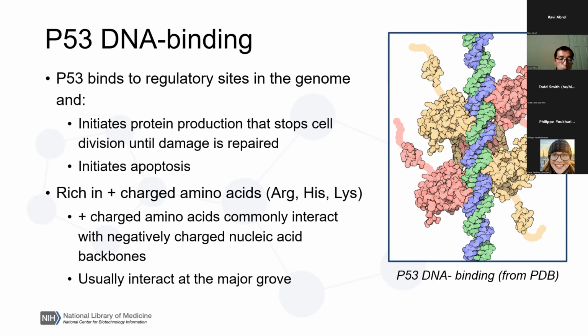It sounds like Ravi's working on some ways to improve how mutation analysis is done in iCn3D. But I do think this is a really cool and quick way to look at how small structural changes might influence things like protein DNA interactions. This is pretty similar to PyMOL mutagenesis for those of you who are native to PyMOL. Very powerful tool. I think iCn3D just makes it really easy. This is one of the favorite things I show people who are undergrads getting started, so they can understand the practical application of some of the analysis in iCn3D.